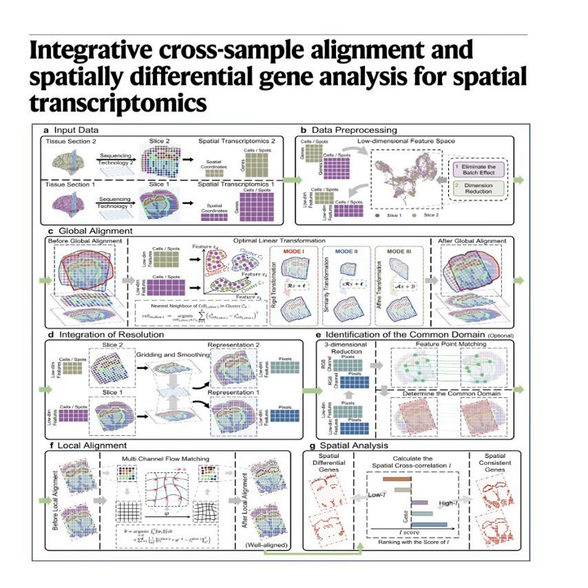Exactly. Even worse, as we'll see, traditional analysis frequently misses crucial disease markers entirely because it's only counting the total number of genes, not looking at where they are located. But by the end of this deep dive, you will understand exactly how CODA solves this massive biological jigsaw puzzle, why it's dramatically faster than its competitors, and how it uncovered hidden heart disease genes that other tools just completely missed. It really is a paradigm shift in spatial biology.